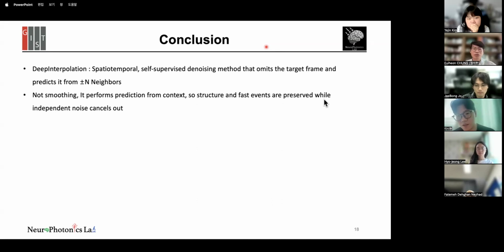So I put some comments on this choice of K and the duration. I don't agree with Xian that a larger N will give better results. We are actually using spatial temporal information, and especially the temporal information here is based on the characteristics of, in this case, the calcium imaging transient. So just a longer window, as Hyojung also asked, may smoothen the actual signal.